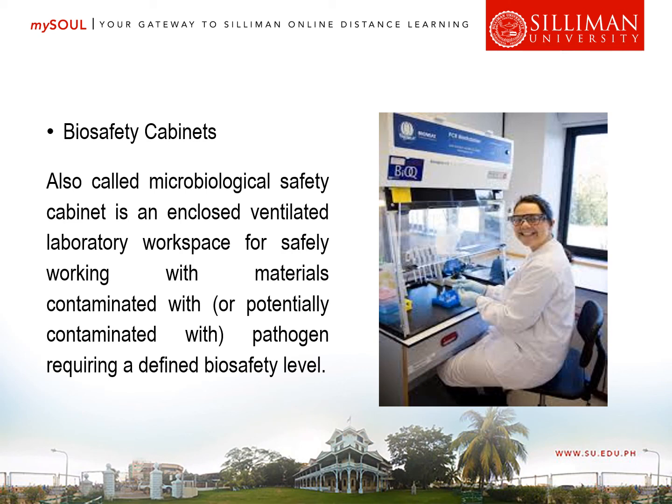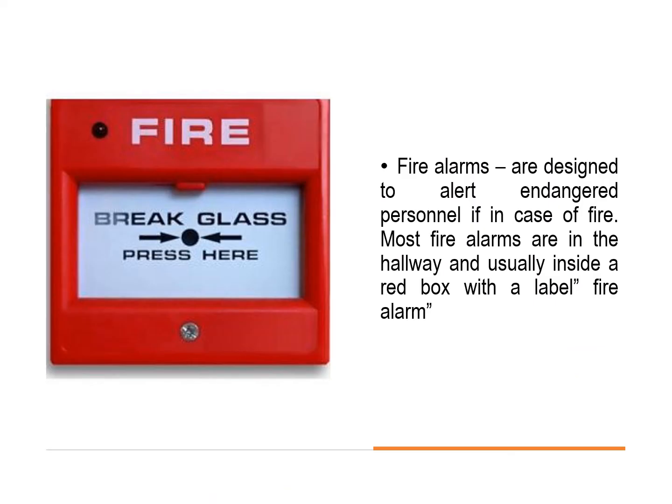You can see biosafety cabinets in the microbiology section when we culture our microorganisms in culture media, when we grow microorganisms from our urine or stool samples, we make use of our biosafety cabinets. Then we have our fire alarms. Our fire alarms are designed to alert endangered personnel in case of fire.